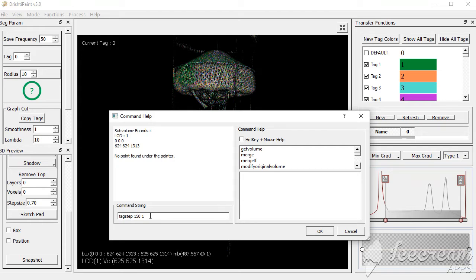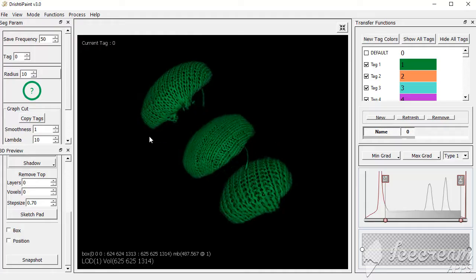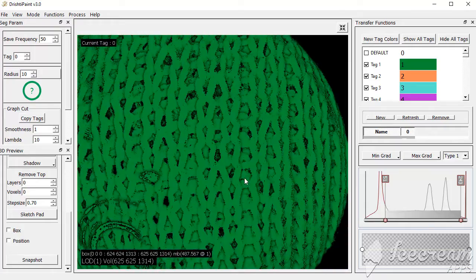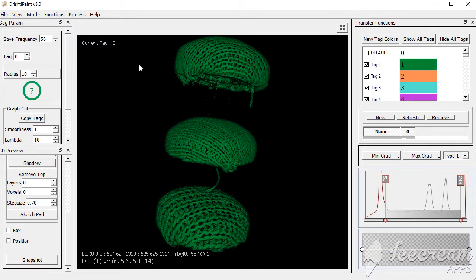So if the probability is beyond say 50%, 60%, then that's the thread. So these are the threads. That's what we get here. And our initial guess was, I had checkpointed that, so let me just look.